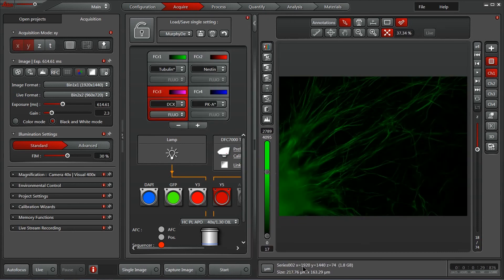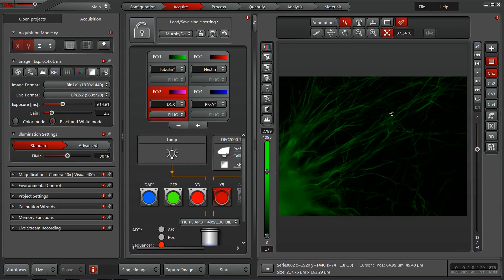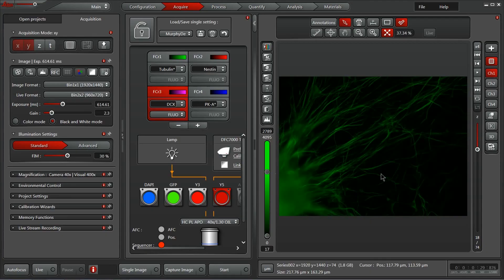On the right side as well, we have an image displayed in microns here. We can change that to pixels if we prefer. And if you hover over any position, the cursor position will show up, giving you that XY location in either microns or pixels if you prefer.